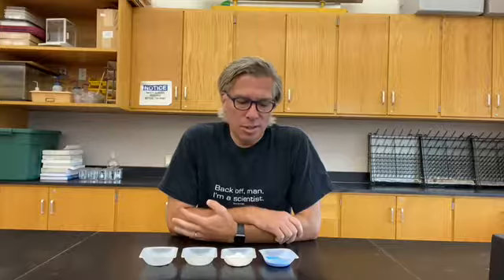Not all bonds are created equal though. Some are very strong and some are very weak, and that results in differences in properties. So we're going to run a few tests and see how the properties of these substances are different from each other. First, we'll do the "what does this stuff look like" test.